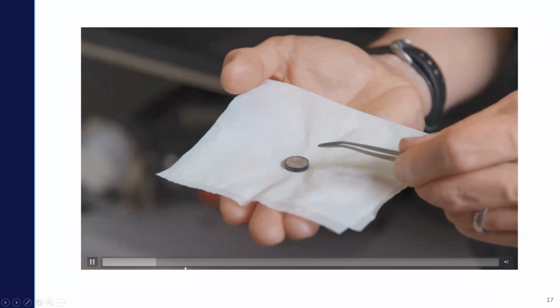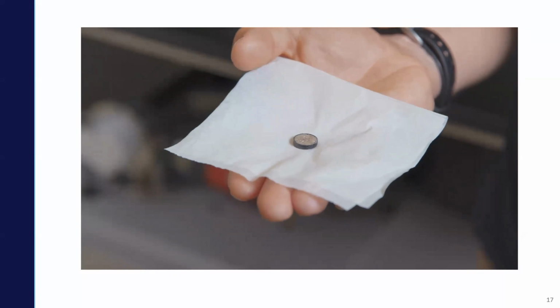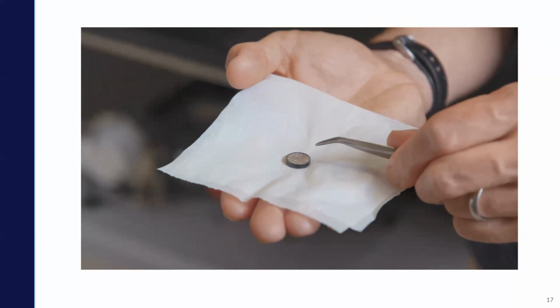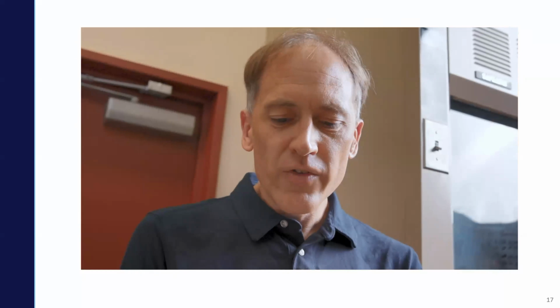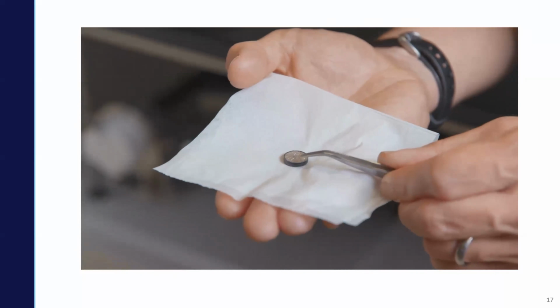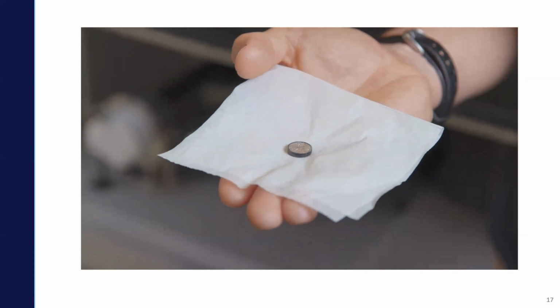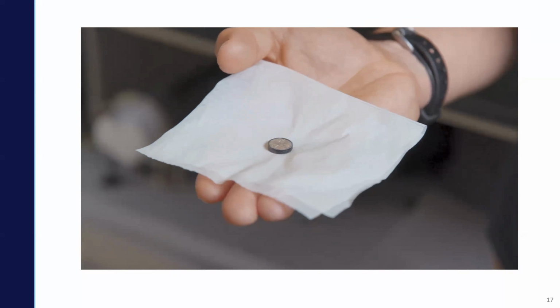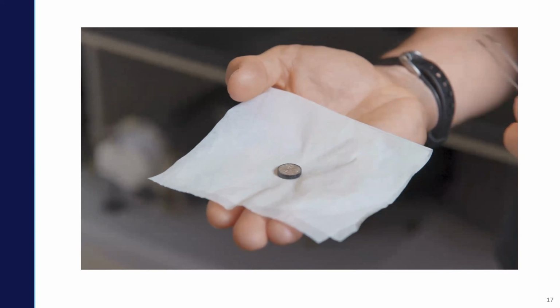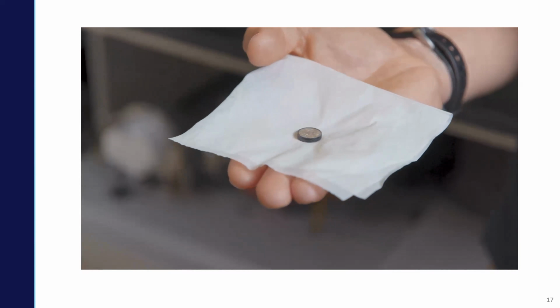One of the nice features of this is that while it's a very destructive sampling, that destruction is very spatially focused. So we have plenty of material left here for other types of analysis. What's also very hard to see is that we have complete control over where we want to place these ablation pits. We tend to place them about 200 microns apart, but we could place them closer together if we wanted to. And we can align them so that we're clearly looking at the decrease in 13C that we observe as you get further and further away from the root itself.